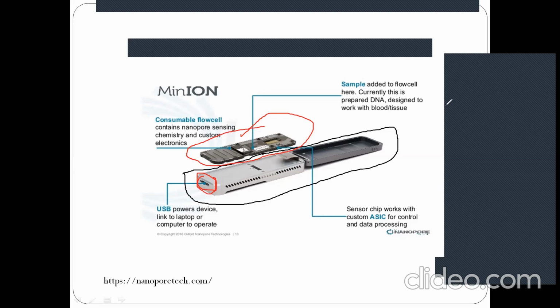Sometimes, due to inadequate cleaning, or what we call CIP, cleaning in place, if the CIP of an instrument like this is not done adequately, things can go wrong. Normally there are 960 nanopores on the surface of the flow cell once you purchase it.